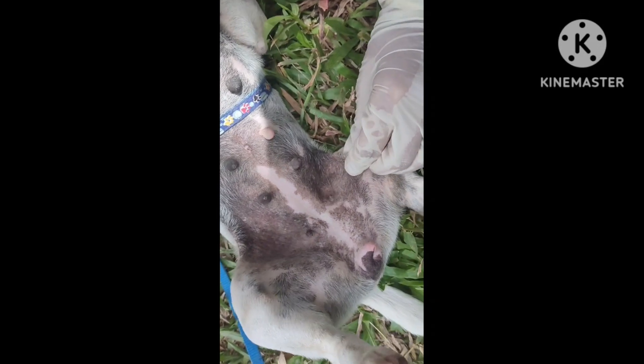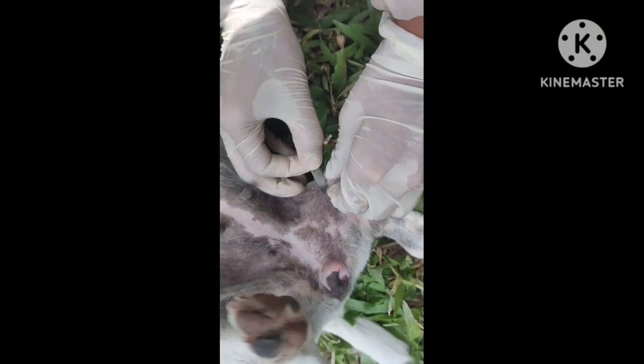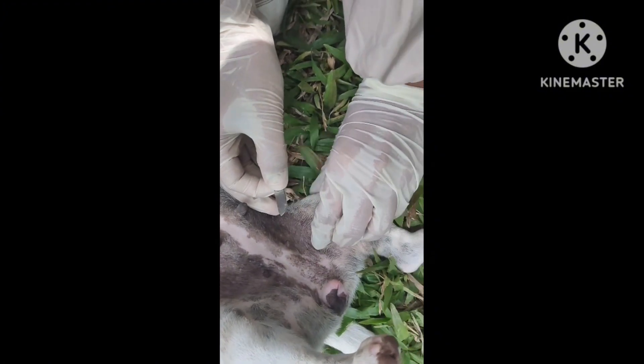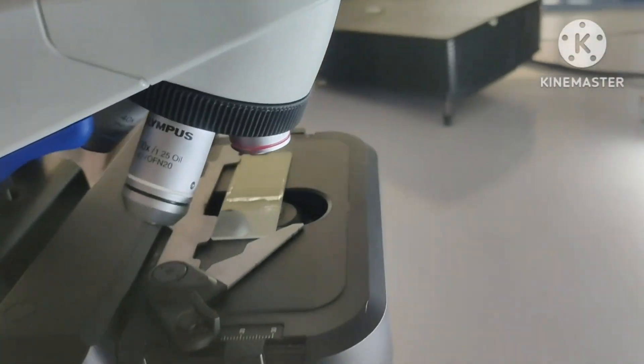Scrape the skin in the direction of hair growth with a blade or spatula covered with mineral oil until capillary beading is observed. Then put the material on the slide and place the slide under the microscope.